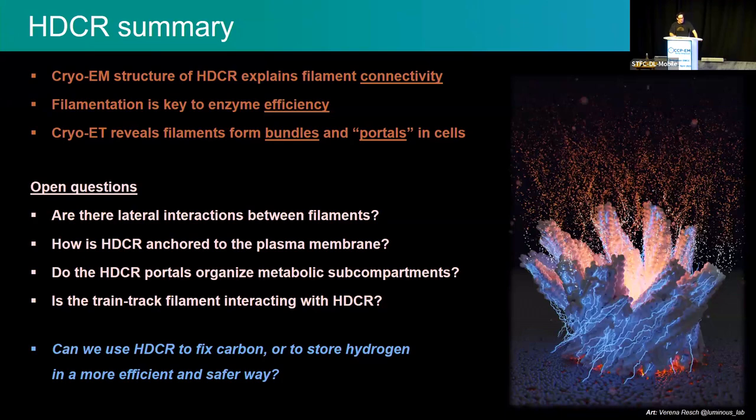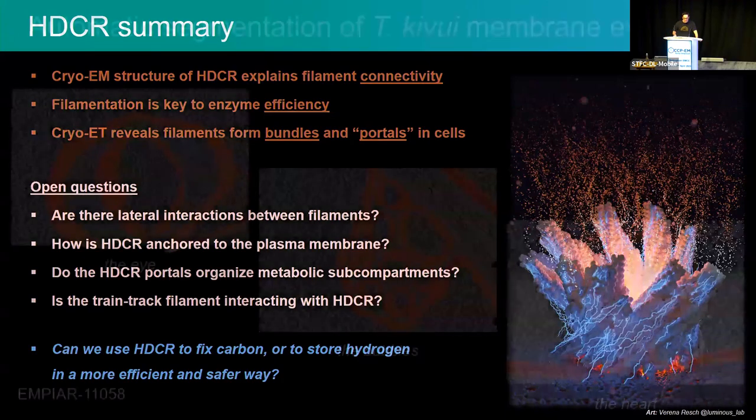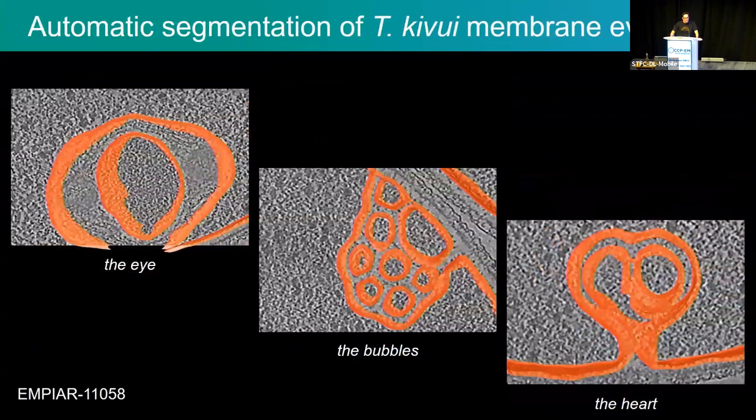Now heading to the second part of my talk, still in the same data set from TKV, I mentioned that we see several interesting membrane events in there. So there are some cell division events, and some compartment formations. And if you are interested in these things, I recommend you to take a look at this data set.